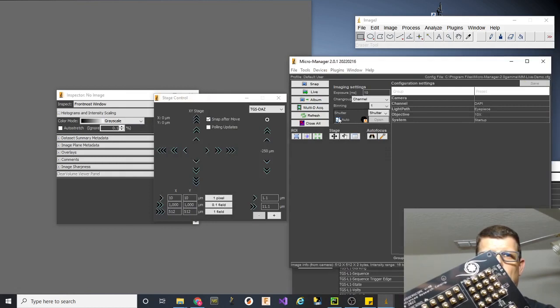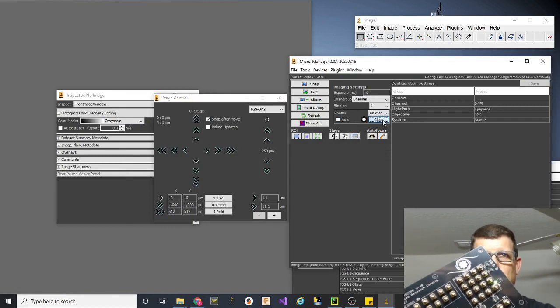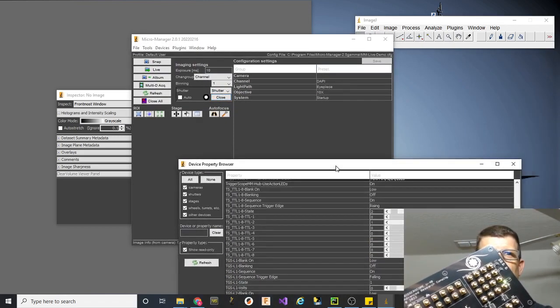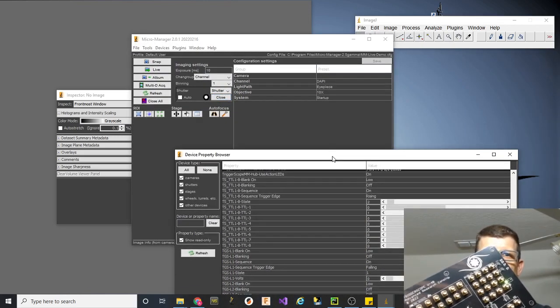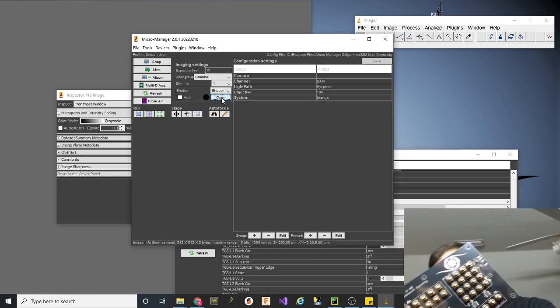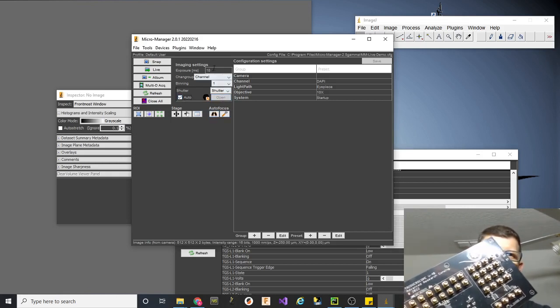So if I come over and open my shutter now, the TTL output has turned on. And the reason for that is I've set the output underneath the shutter control. So what this means, if I turn this back off, yeah, so now I use the shutter and it should turn off and on.